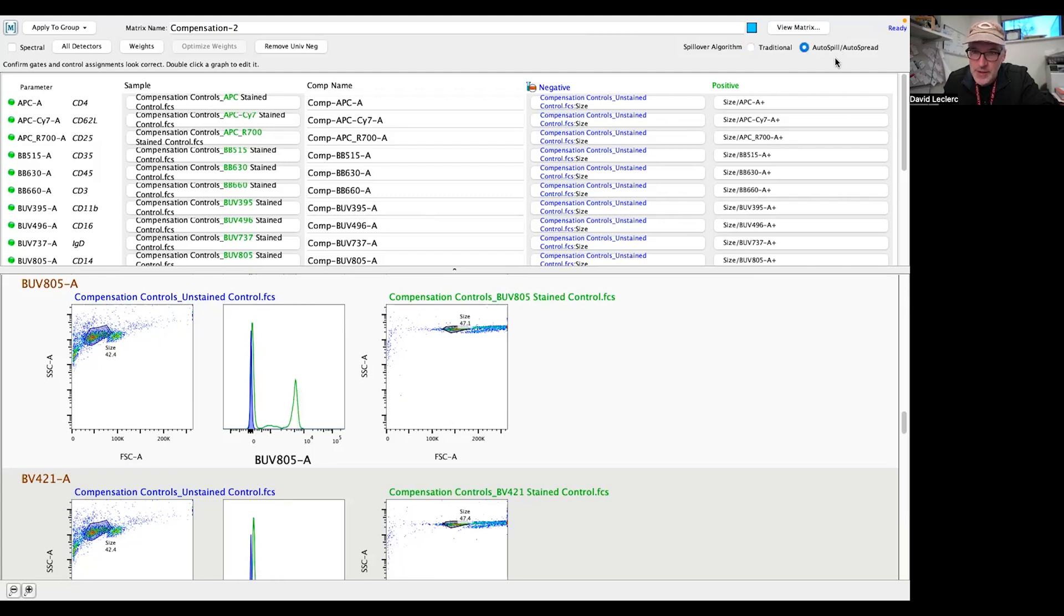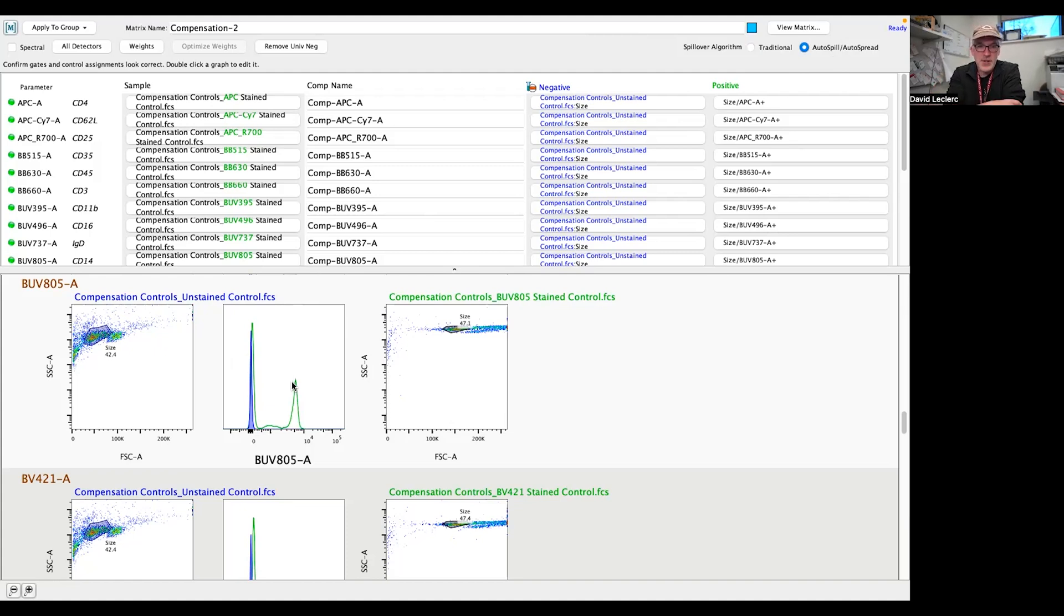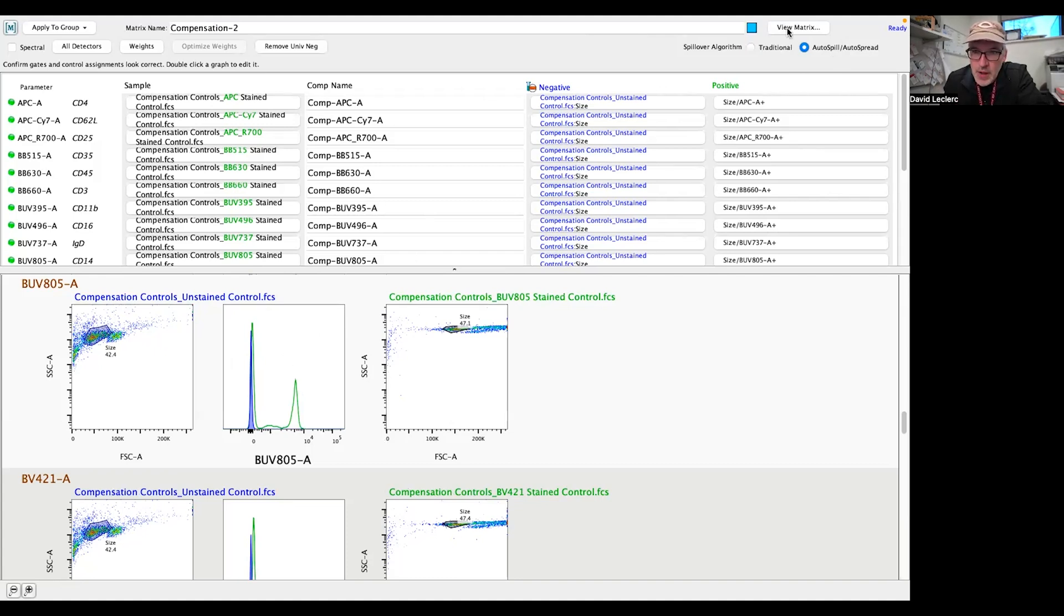is basically, as I click Autospill, all these gates disappear, and now it's going to use this linear regression method to calculate the spillover matrix. And so now I can just go ahead and view my matrix.